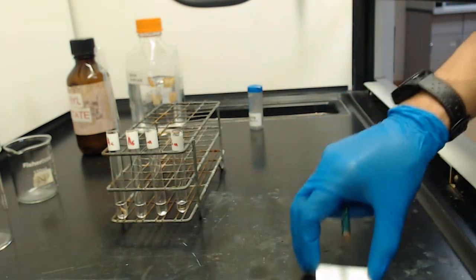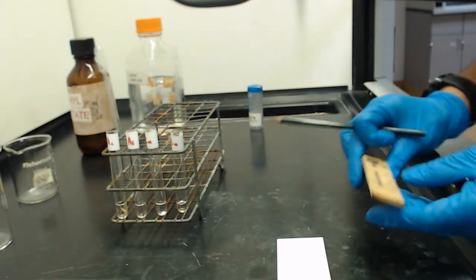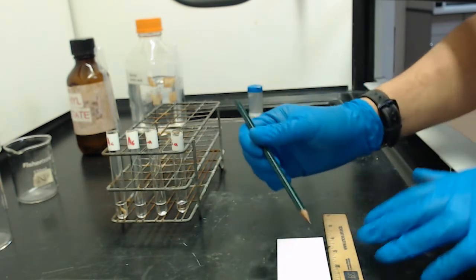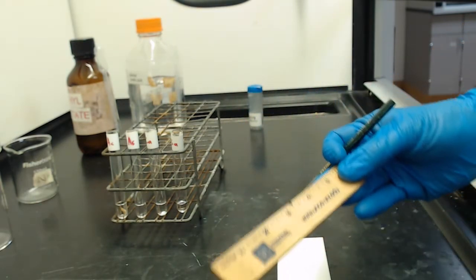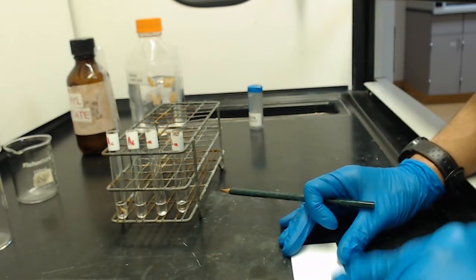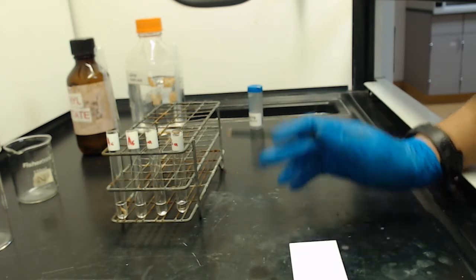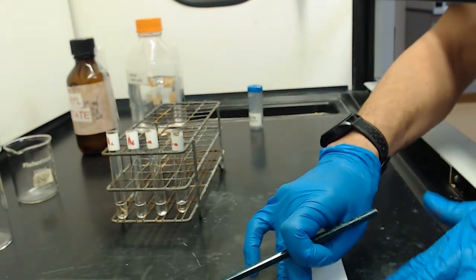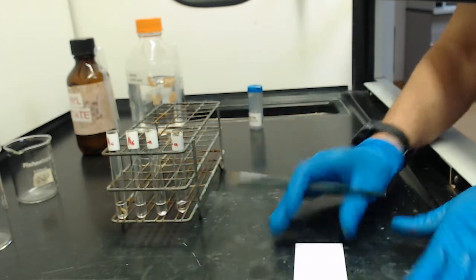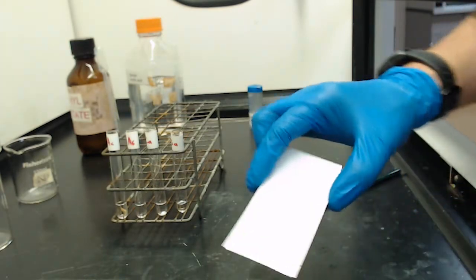Okay. So I'm going to go ahead and draw a line roughly a centimeter in height from the edge here. You don't have to be exact. This doesn't even measure in centimeters, actually, it's an inch ruler. But I'm just going to eyeball it to be about there. The key is that it's straight across. Try not to get it crooked, and draw a soft, light line on there. Like that. I barely dragged across it. It's going to be really faint, like so.